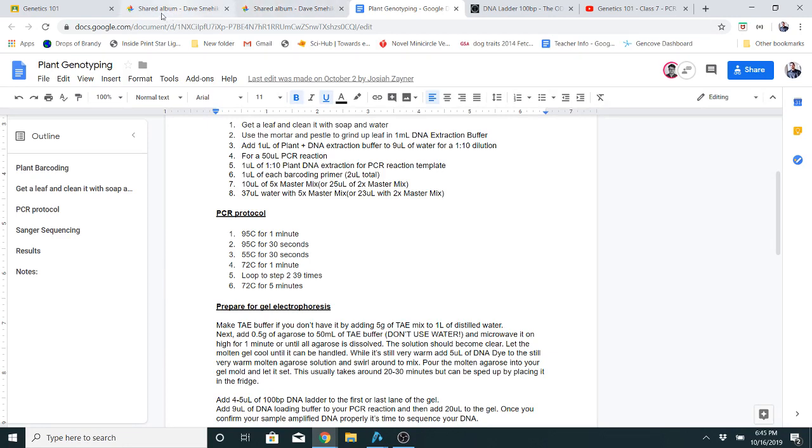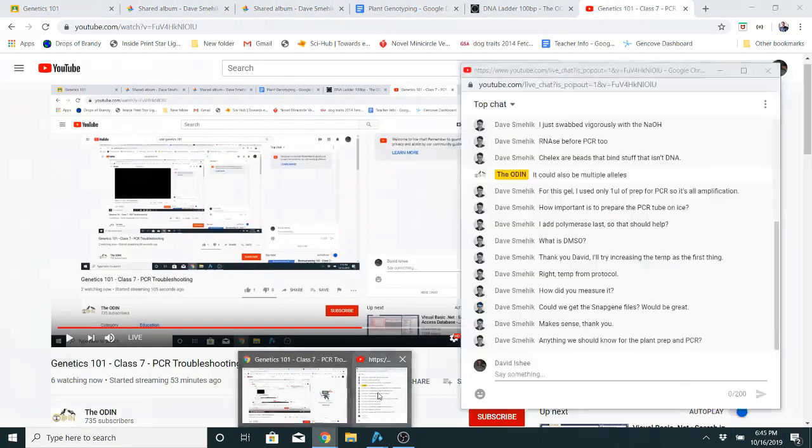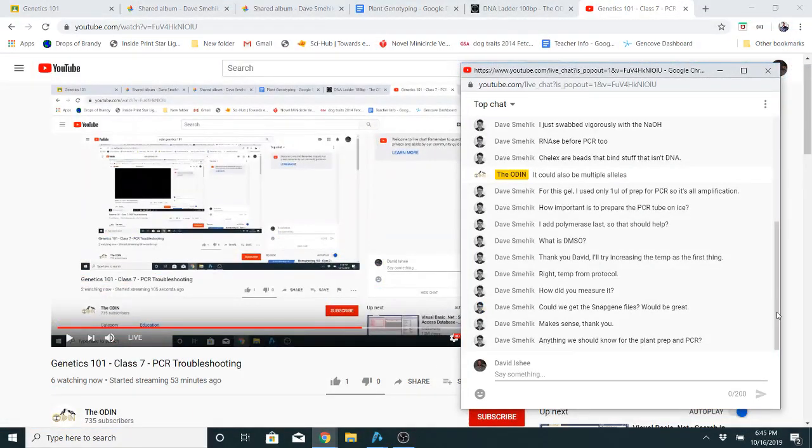If you have any PCR issues or gels from the plant PCR, do it. If I were you, instead of just trying to focus down on the first one, I would run all of these. Run each one and then run a gel on all of them. That way you can save a little time and you don't get so far behind. Hopefully the plant one will work better than the DRD4 for you.